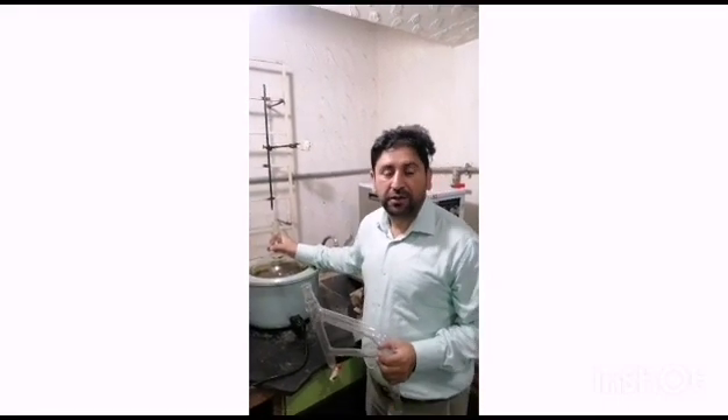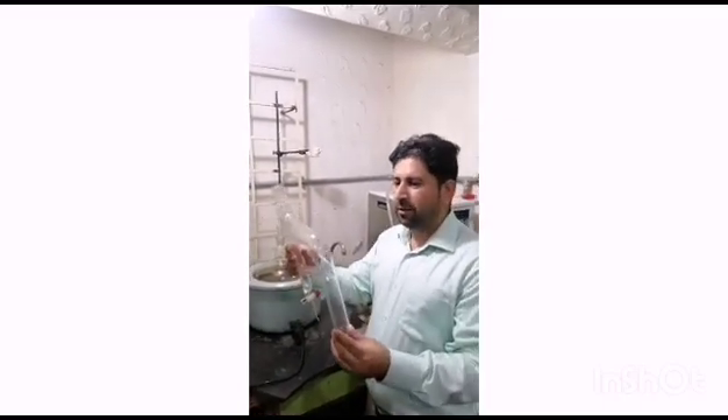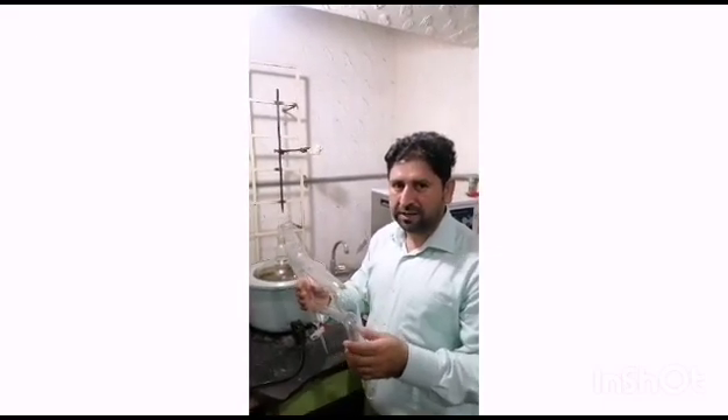Hello, so today we are going to tell you about the setup of Clevenger Apparatus. This is a Clevenger Apparatus — this is a designed Clevenger Apparatus, and there are many types of Clevenger Apparatus available in the market.